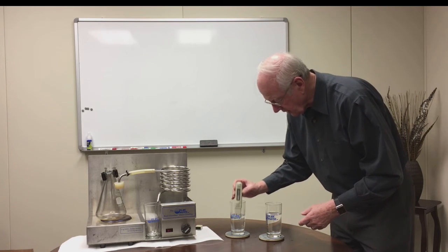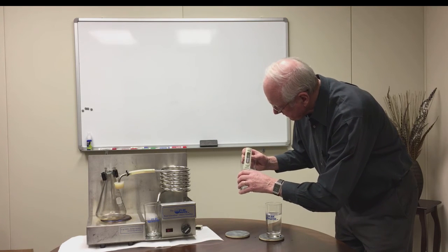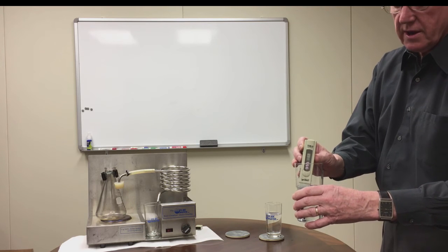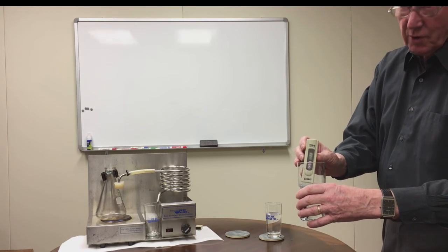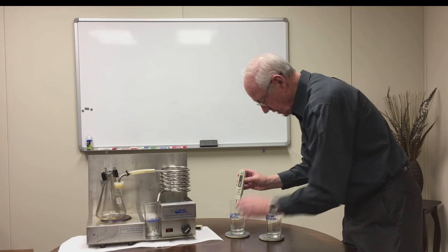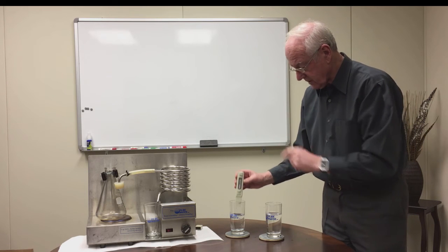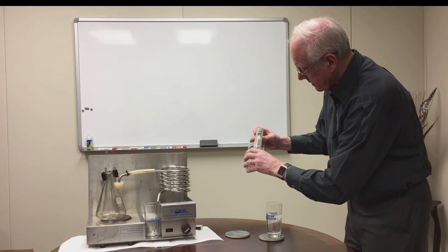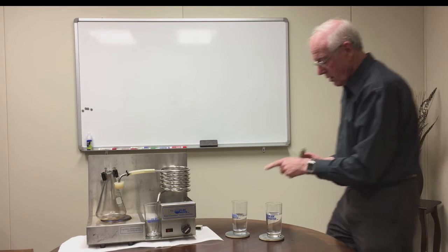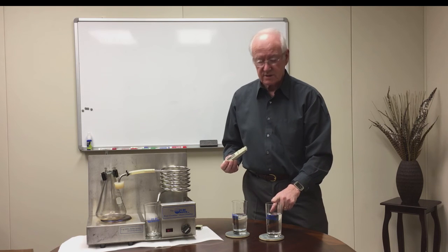Going back to the distilled water — shake it off a little bit and take a look at it. It's now reading 001. So we've gone from 308 down to 001. The one is there because we probably had some water droplets that were contaminated, and when I put it in here it didn't dilute out properly. But we know it started at 000. So one part per million here, and 308 parts per million in this glass. This is the tap water.